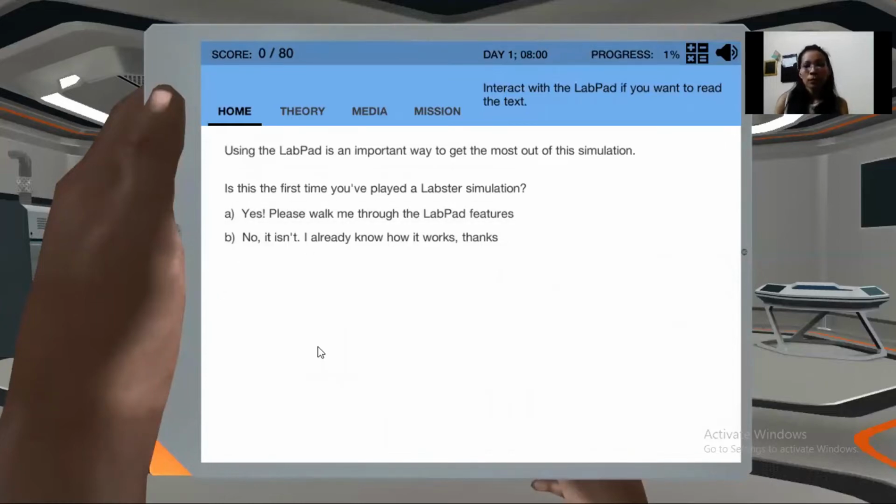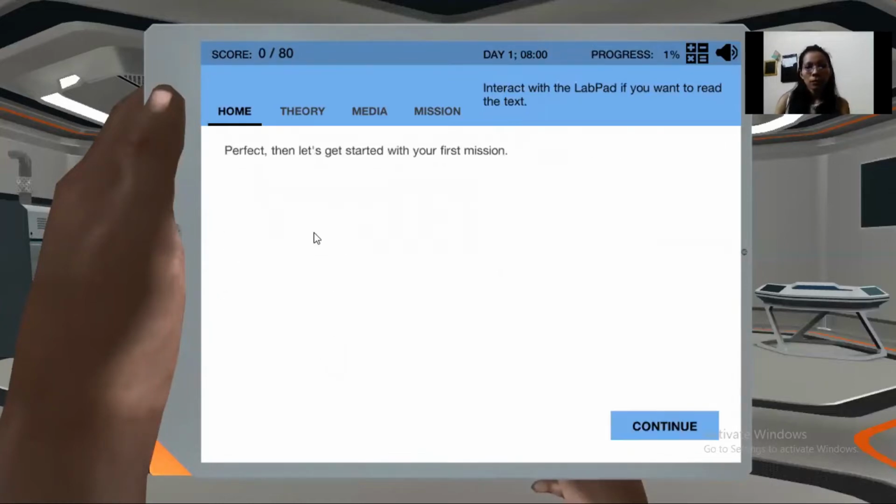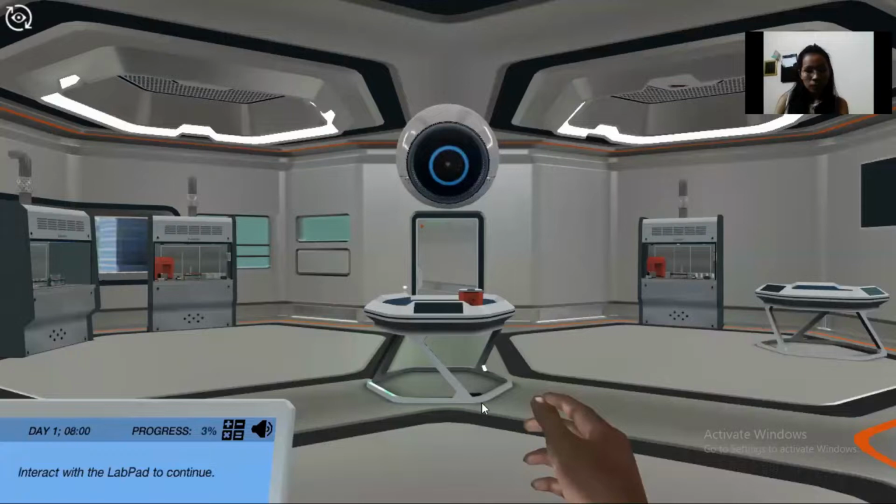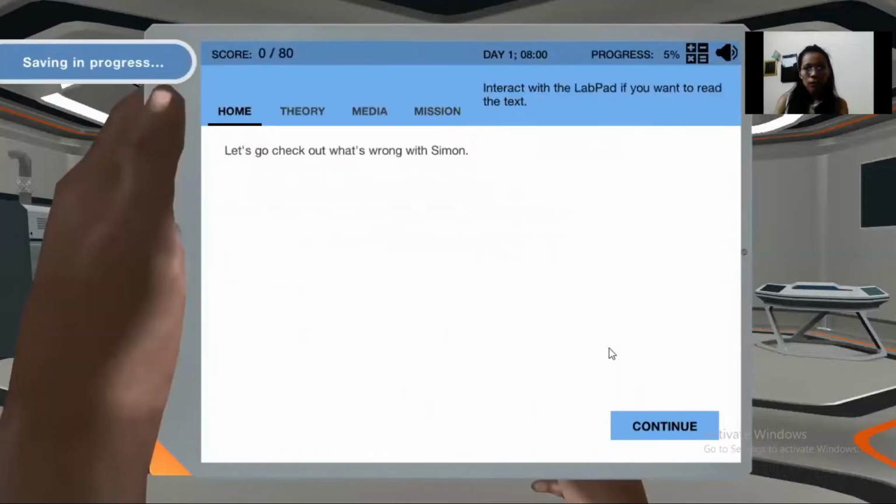Is this the first time you've played a Labster simulation? Perfect. Then let's get started with your first mission. Let's go check out what's wrong with Simon.